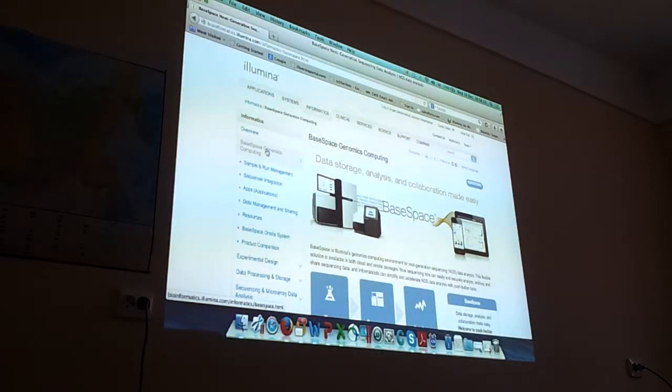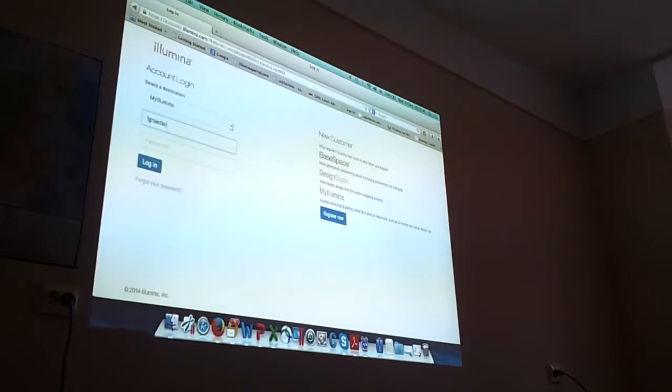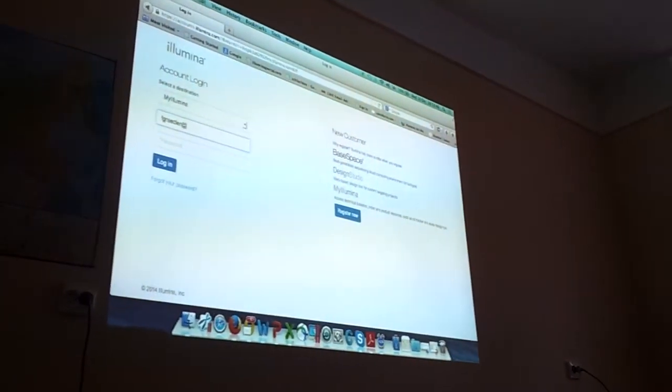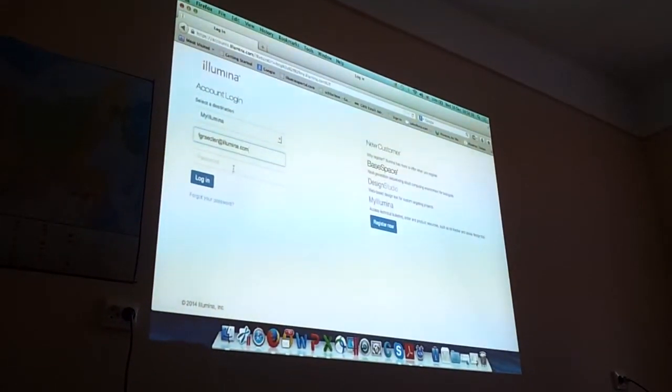You have to log in. Yes, first. I'm just wondering why. Okay. Does anyone have my Illumina account? I will just use mine. I hope I remember. So I remember everything.